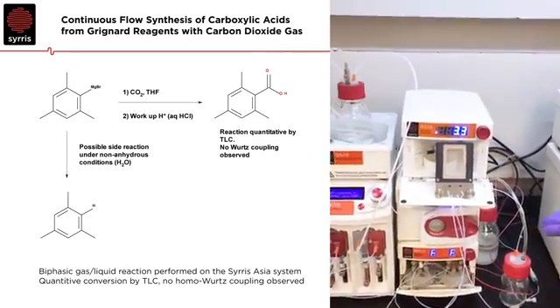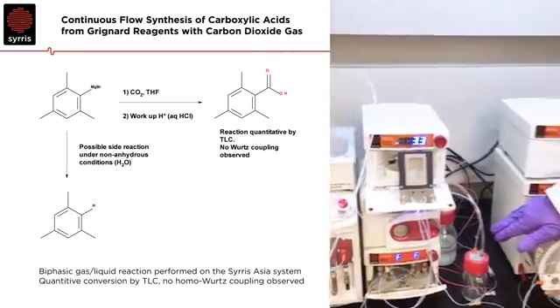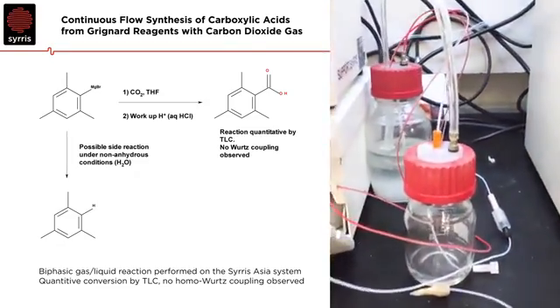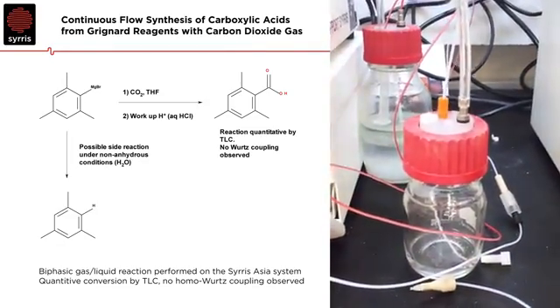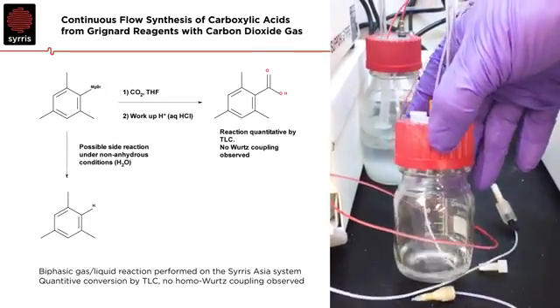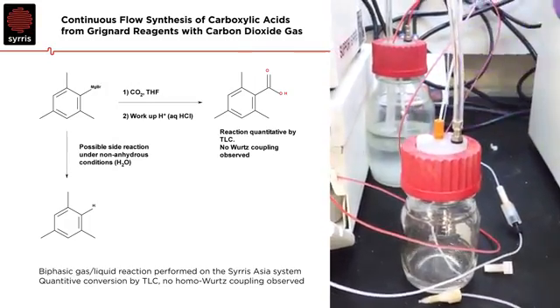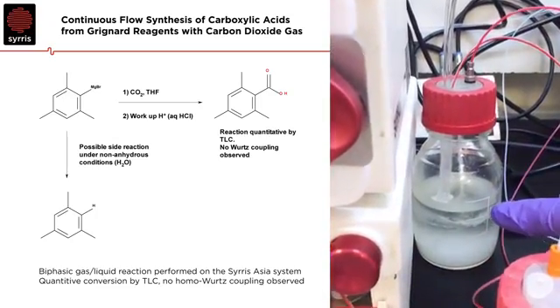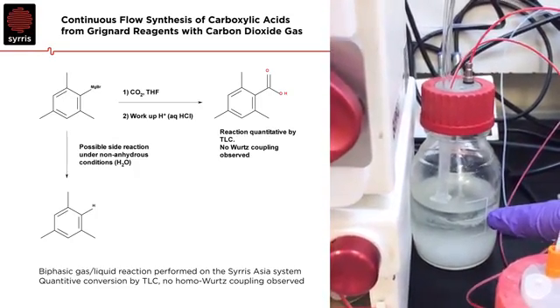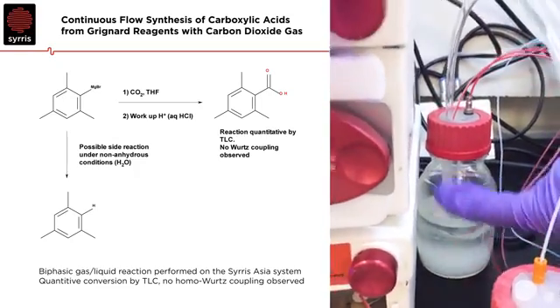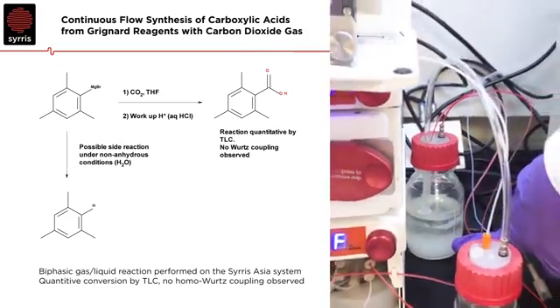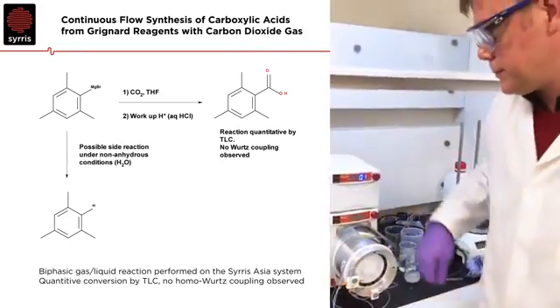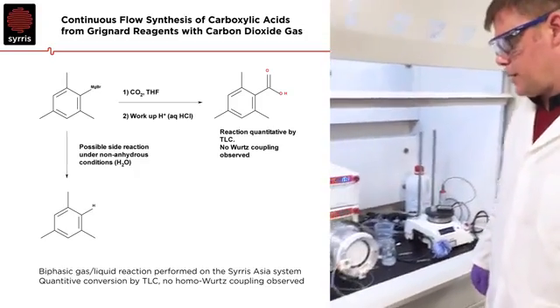One thing to note is, as we're using carbon dioxide, we need to handle this carefully. So our output is going via our back pressure regulator into our acidic quench, which is coming out under a sealed condition into a scrubbing vessel with sodium hydroxide. And you can see the build up of our by-products — carbon dioxide — in the bottom.